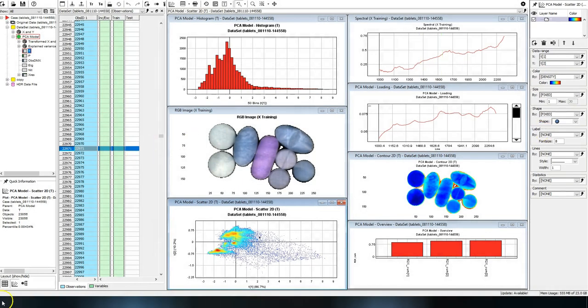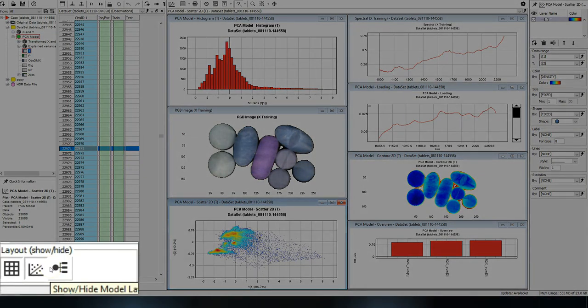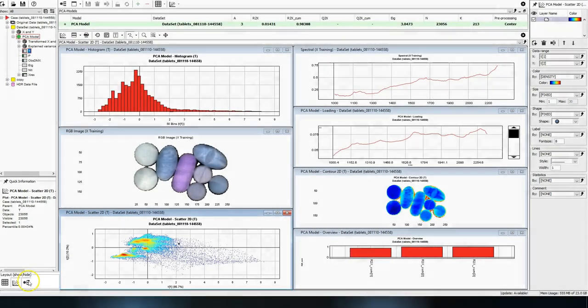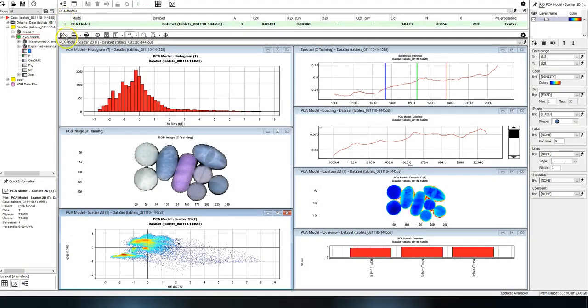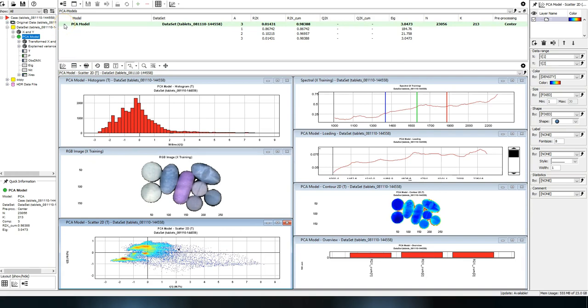In the layout menu, you can select if you want to show the table, plot, or model areas.